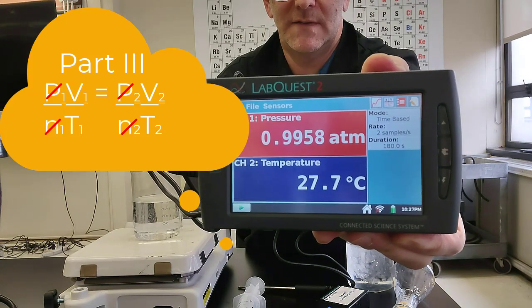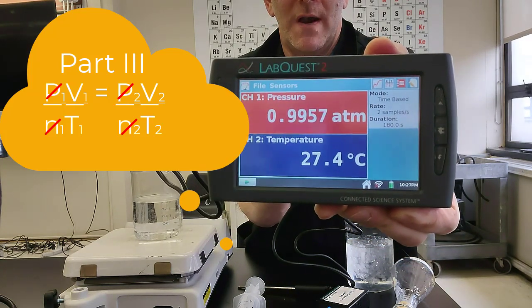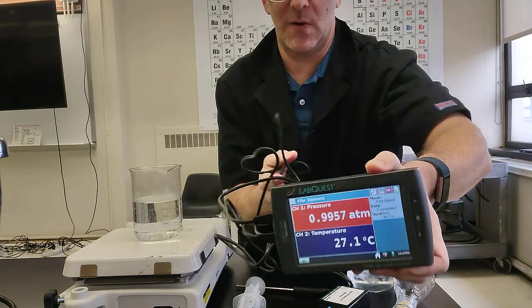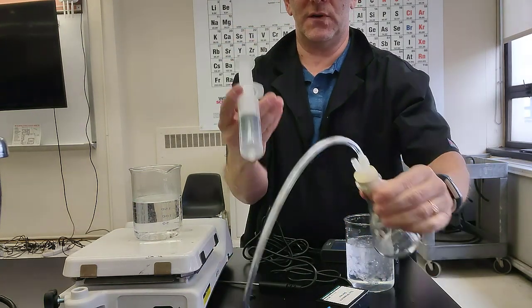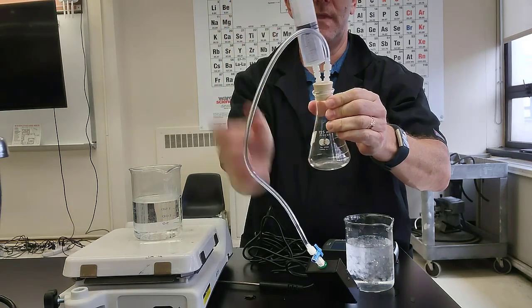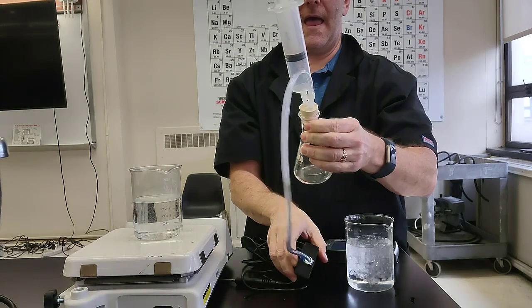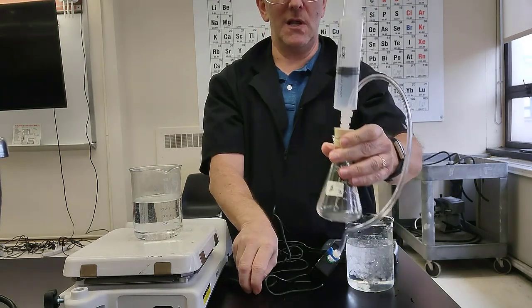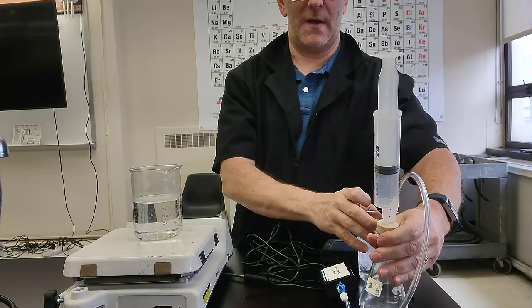Now, Charles's law is volume versus temperature, so we're not going to use the pressure sensor, but I wanted to have it hooked up just to show you that it stays relatively constant, so that we're only changing one variable at a time. I'll hook up the syringe to one of the ports on my Erlenmeyer flask, and the other port is hooked up to the pressure sensor. And it's at half the volume so that we can see qualitatively what happens when I immerse it in my hot water bath and in my ice bath.